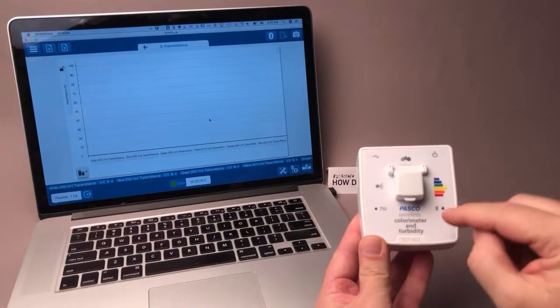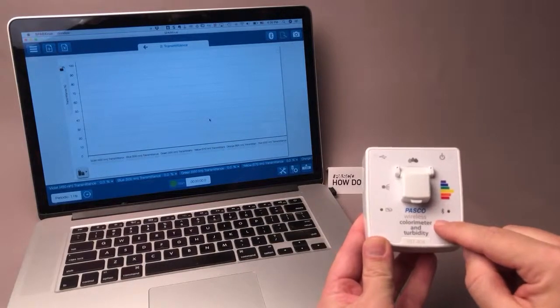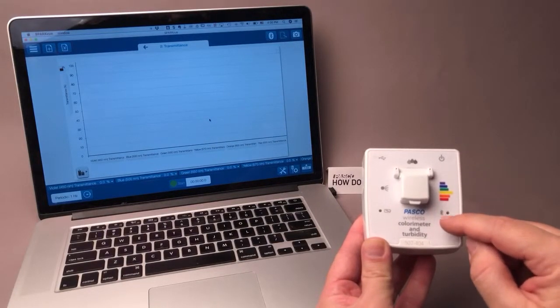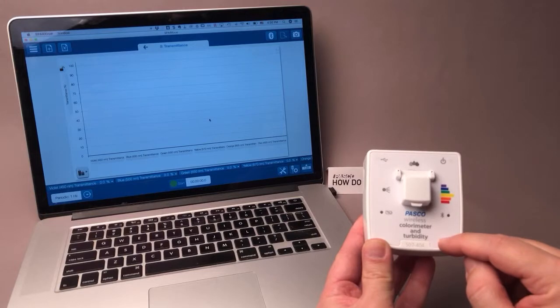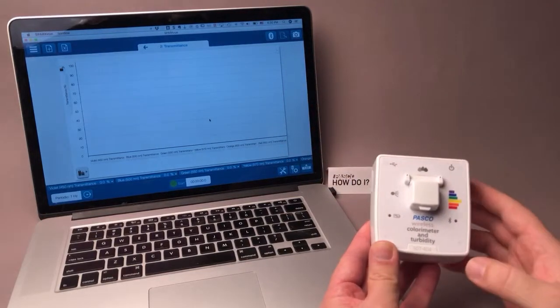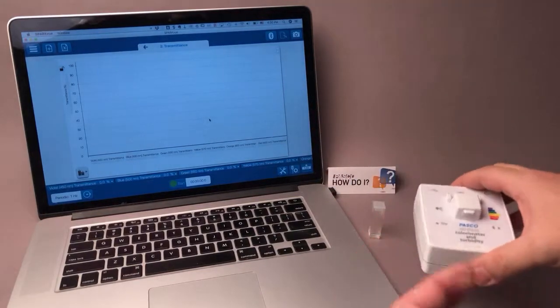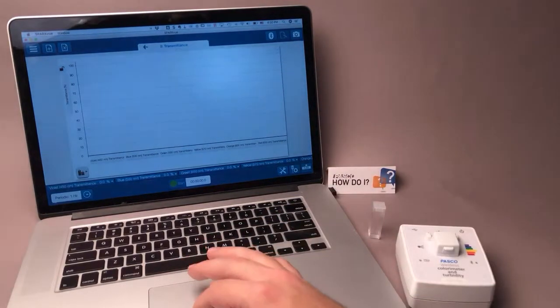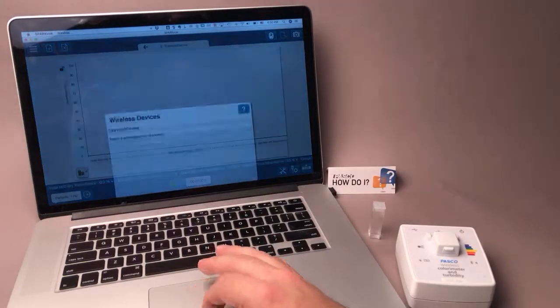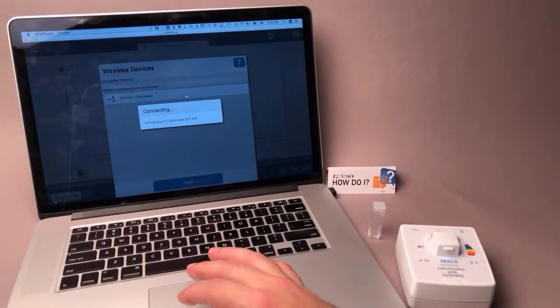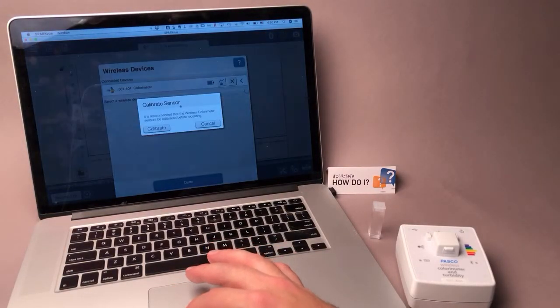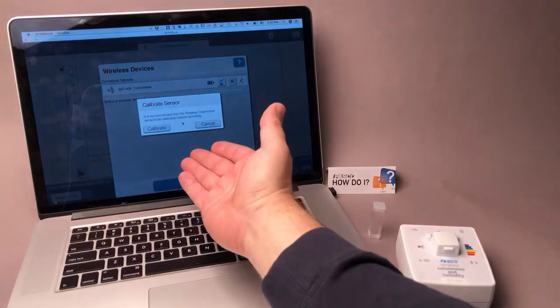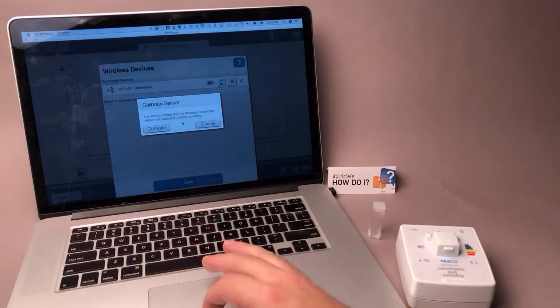How do I calibrate the colorimeter measurement of the PASCO Wireless Colorimeter and Turbidity sensor when using SparkView software? Under most circumstances, when you first connect the sensor to SparkView, SparkView will give you the opportunity to calibrate the sensor.